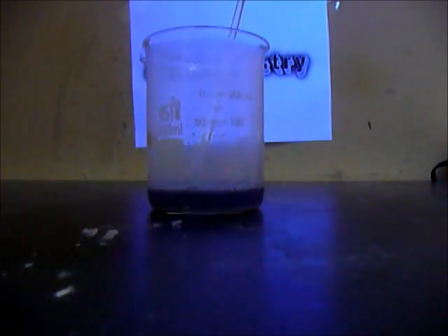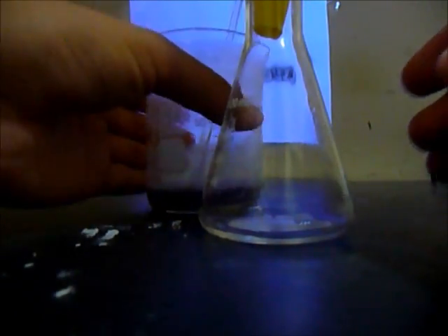Okay, so after making a quick solution, now get a filter and set it up. I'll just be adding some water because it's easier to filter that way. Okay, my filter is ready. And then just put it in a flask and dump in everything. You just put it to the side and I'll show you when it's done filtering. Okay, it's about done. So you can put it to the side and give it a fierce stir so you can make it colder.